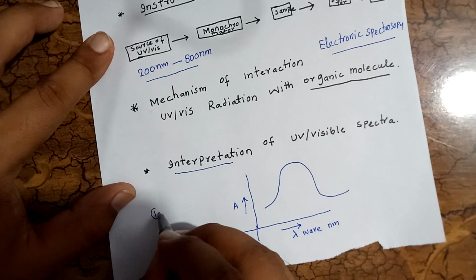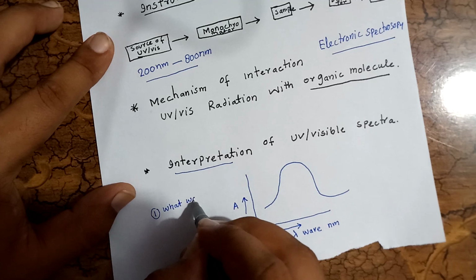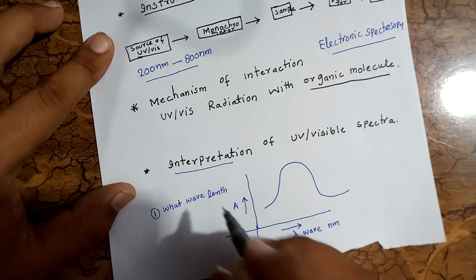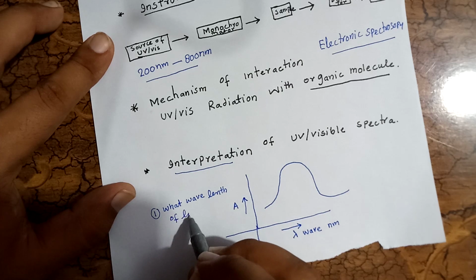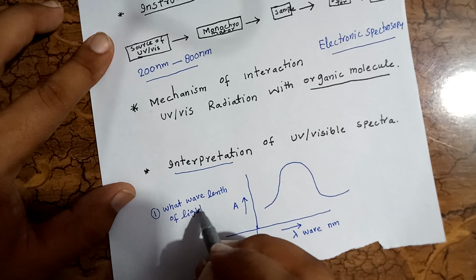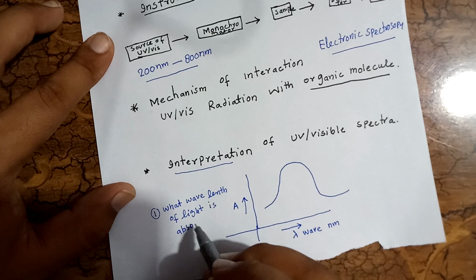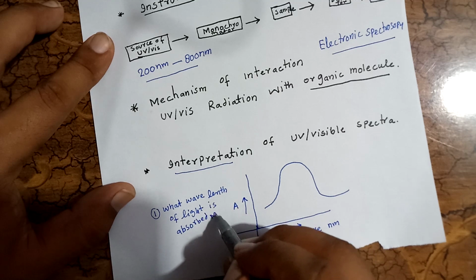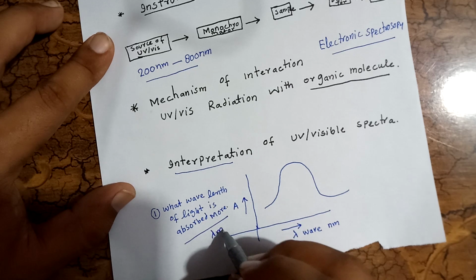Where absorption is maximum, that is lambda max.